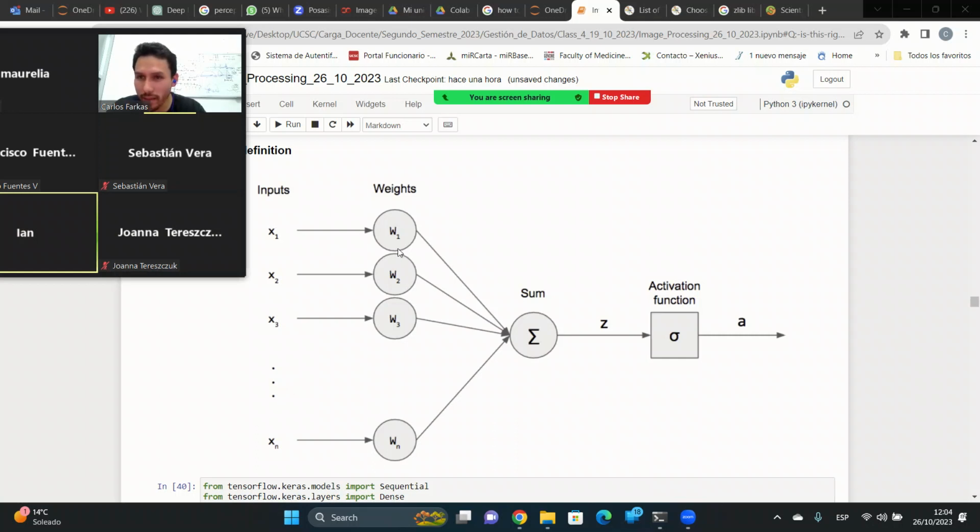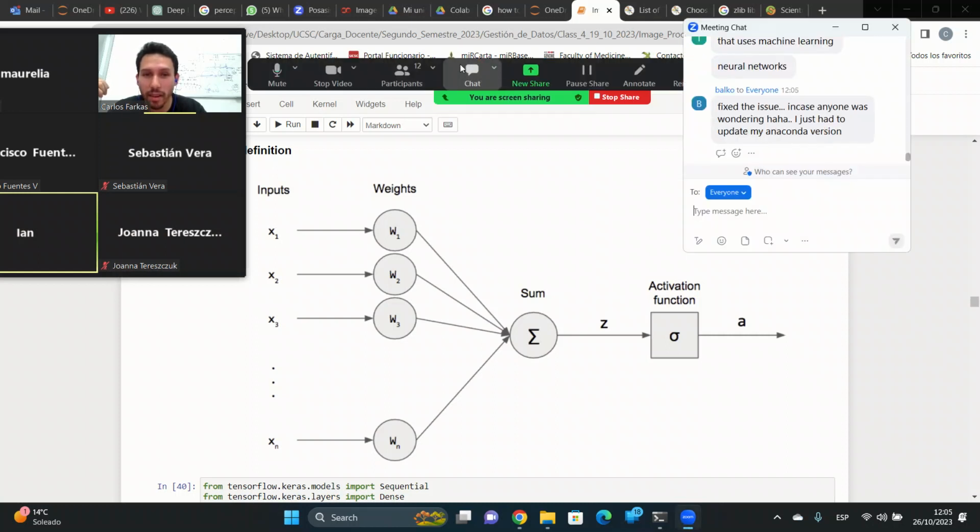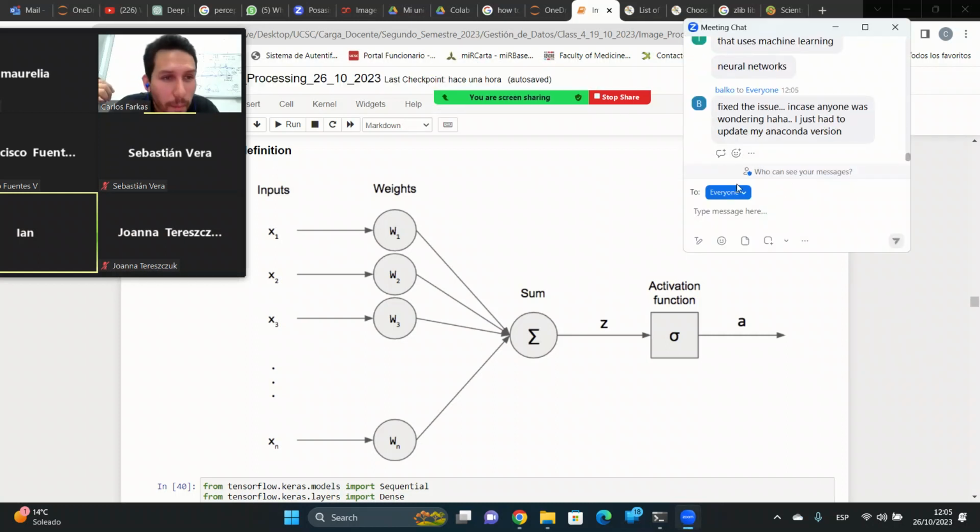And then you will give a weight, peso, and this weight will tell you if this image has a lot of information in terms of pixels or doesn't have any information at all. It is background. Then you will do a sum of every single weight here, and you will program a function, and then you will need to do an activation function. I know this is a lot to take in, but I will briefly explain step by step, and then you will have an output. Okay.